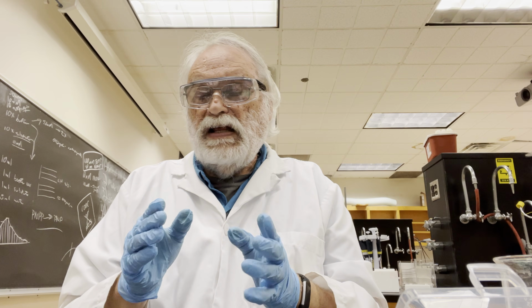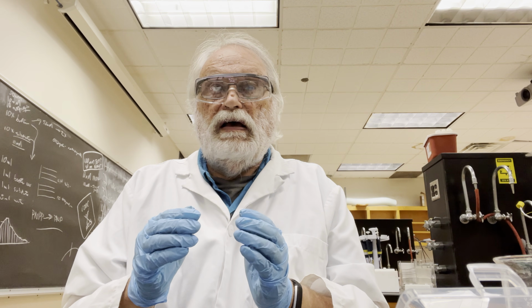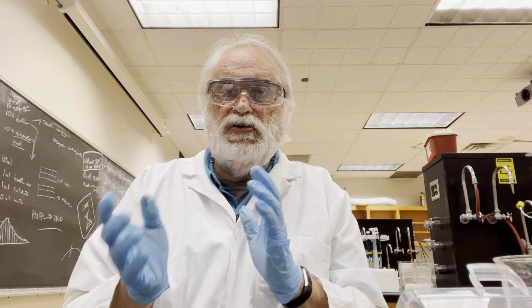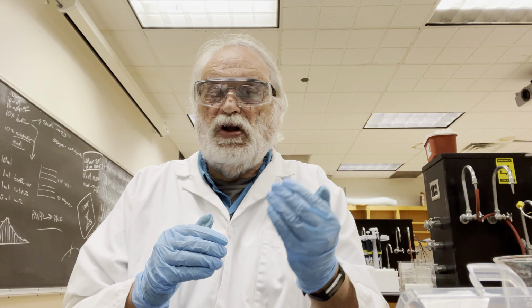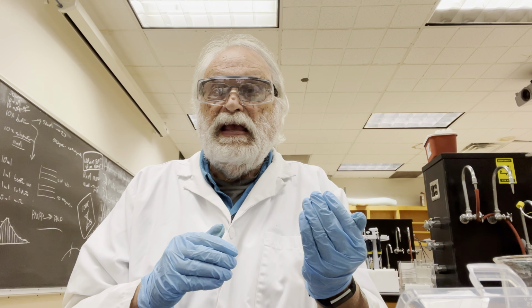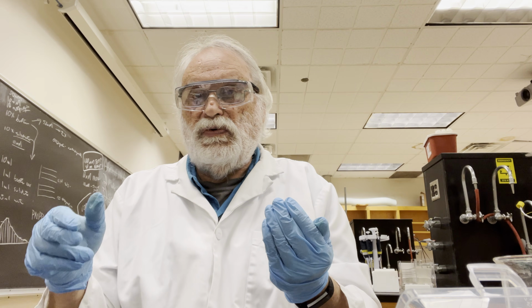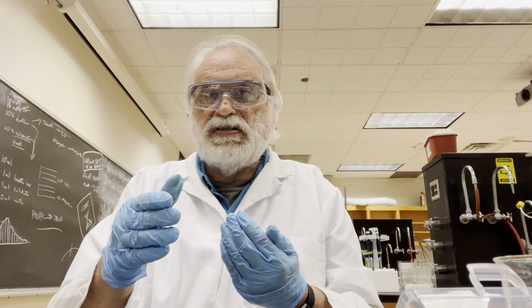All right. Next we have to make a protein standard, and we've done this before. Remember, in the first experiment we did 2 types of serial dilutions. And earlier today we did dilution on the plate, where we took 330 microliters of PNPP, then took 110 out and put it into several wells in a row. This time we'll make a standard in tubes outside.